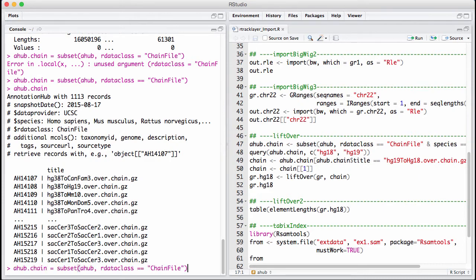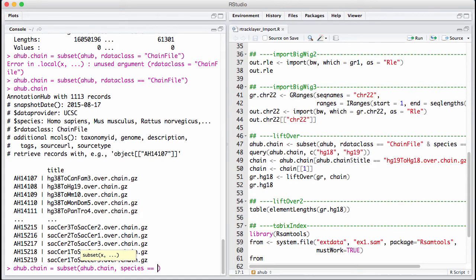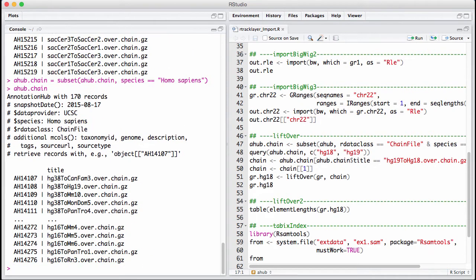We may want to subset this further to only contain human data. And now we see a number of different genome versions. We also recognize a couple of non-human genomes where we can lift over regions from the human genome to various monkeys, for example.